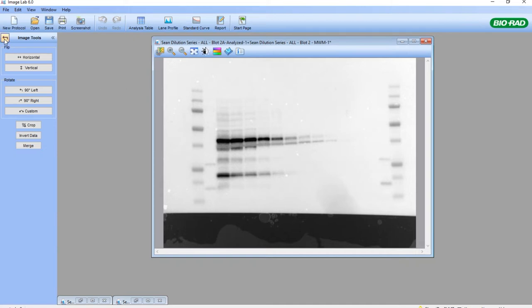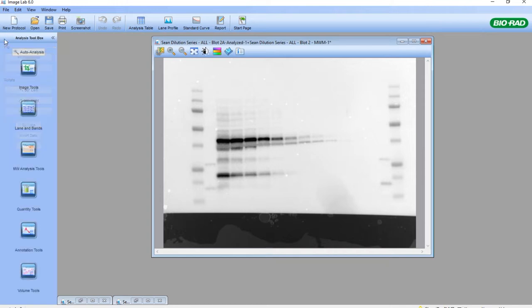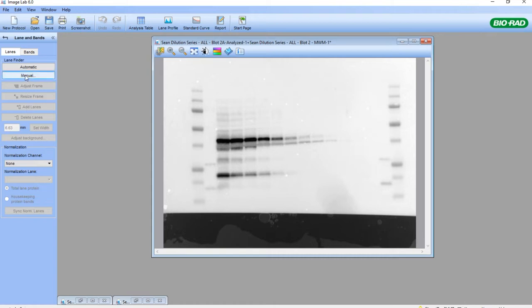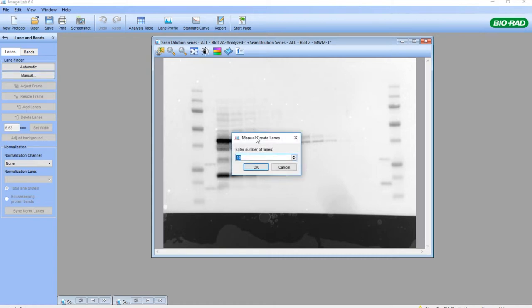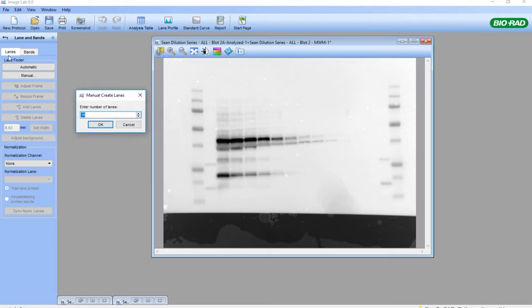We go back to the Toolbox and choose the Lane and Band Tool. Click on Manual. What we want to do is create the correct number of lanes for this membrane. I would like to encapsulate both of the markers on either side of the membrane to get more precise molecular weight analysis of my protein of interest.